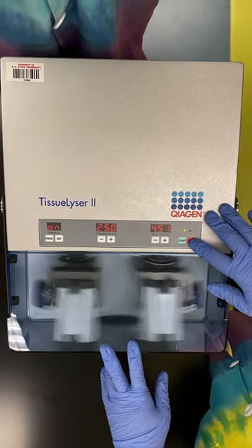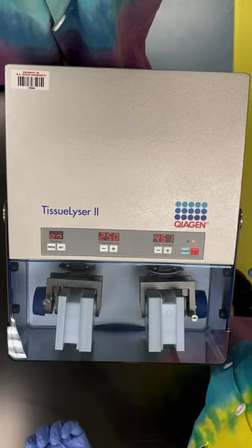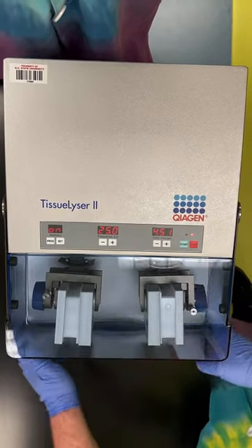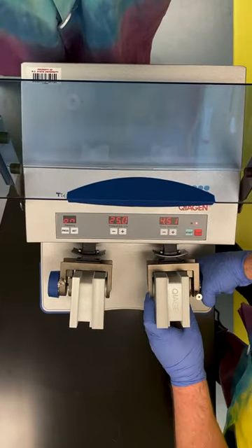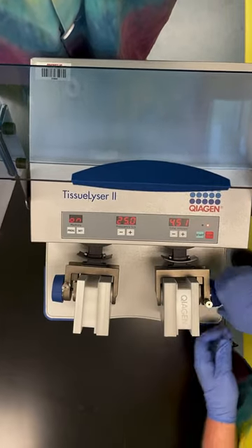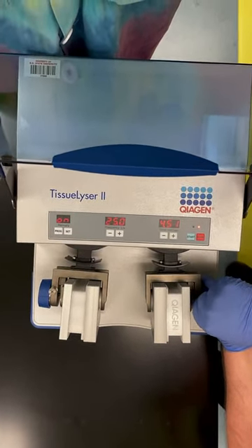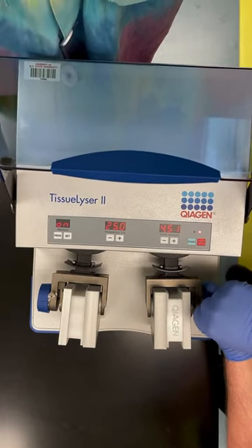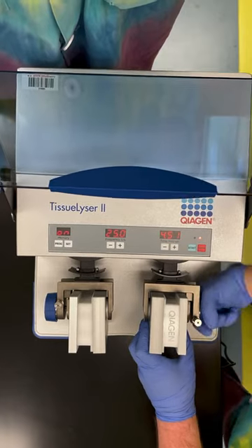In order to stop the run, you hit stop. You can do it prematurely if need be. When we want to reverse the process, make sure it's stopped, open the shield, and then try to crank these open. The problem is the safety is still engaged, so you need to pull up the safety. If it doesn't pull up, you want to tighten it a little bit to make sure it's at its apex. Then you can pull it out of its grooves and hand loosen it.